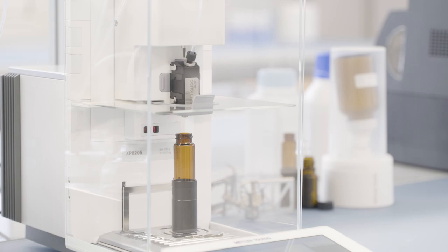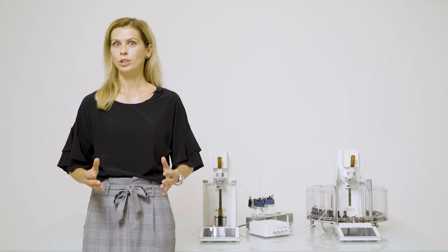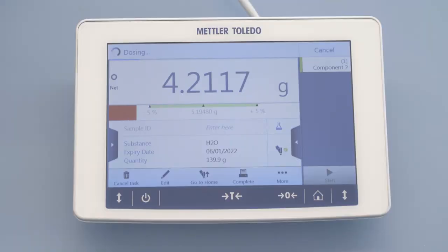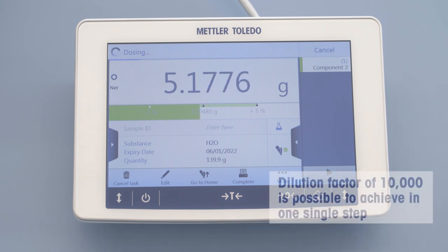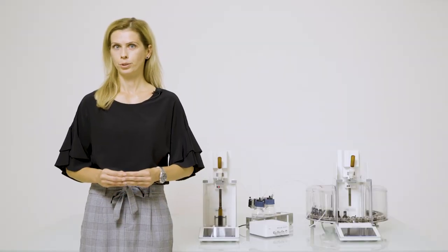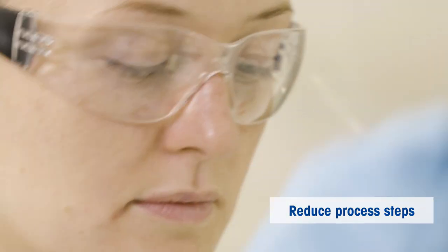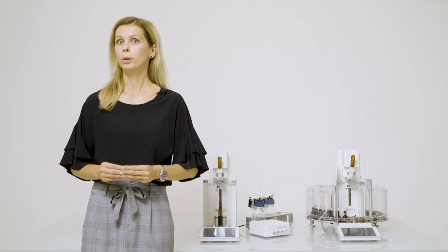The balance calculates the precise amount of solvent required based on the amount of substance dosed in the first step to produce the target concentration. Serial dilutions can be reached efficiently without multiple dilution series, as the XPR Automatic Balance can achieve a dilution factor of even 10,000 in a single step. Thanks to the gravimetric approach, you avoid repetitive, time-consuming manual weighing and reduce process steps. You prepare only the quantity you require, and the automated system enables you to weigh out smaller quantities of samples or standards.